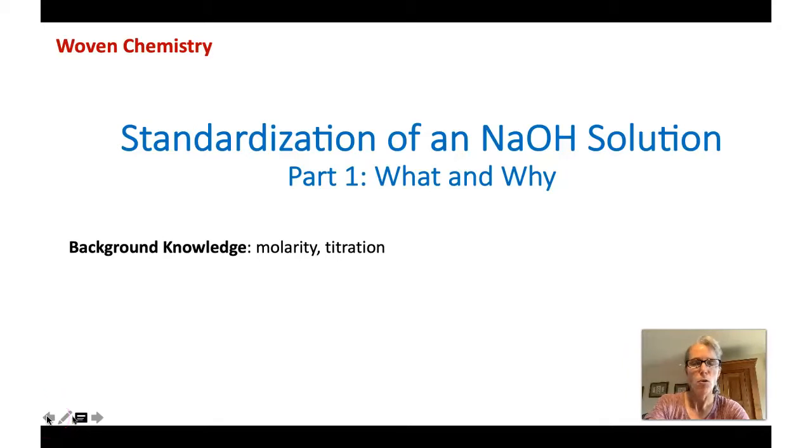Part 2 gets back to my normal mode, in which I'm going to ask you questions that probe your understanding of the procedure for standardizing a solution. It's not about whether you remember the procedure, it's about if you understand what we do and why.